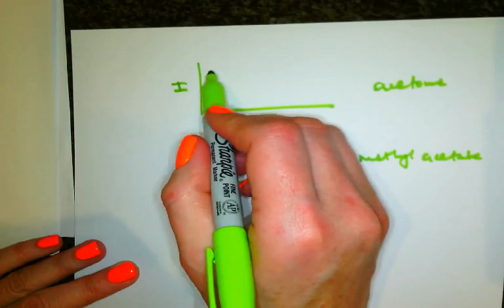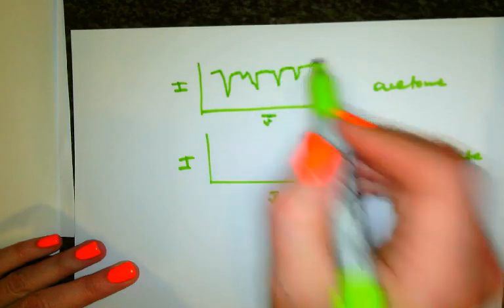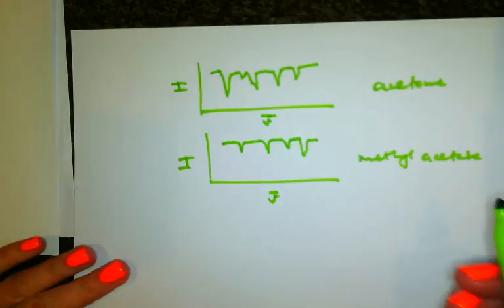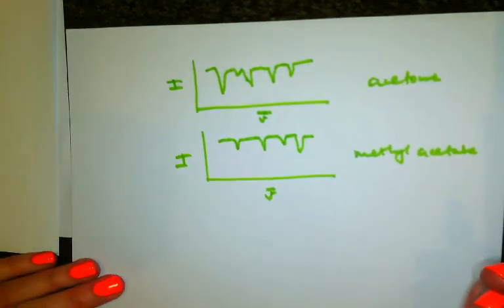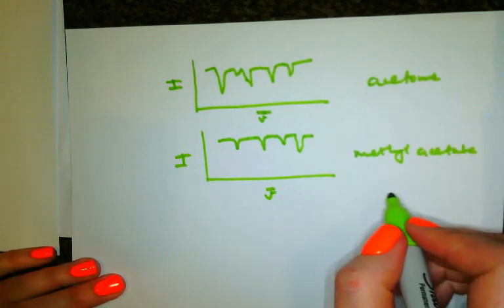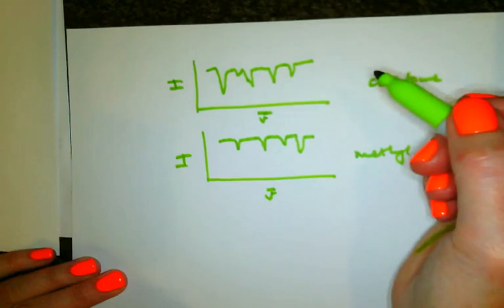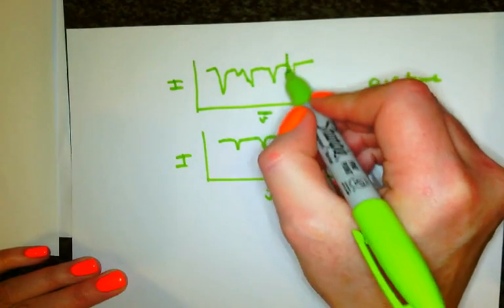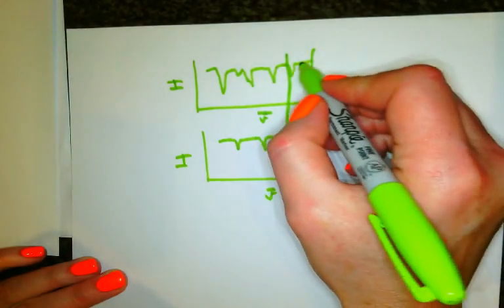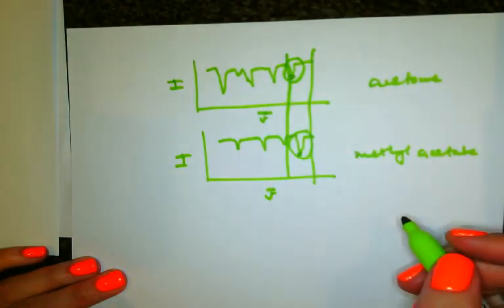And in your spectrum you are going to see a number of peaks, looking like that. And this one will look a bit different. Once you know which region to look at, you will then isolate the specific peak that corresponds to the carbonyl stretch. Let's say Google told you to look, hypothetically, in this region.